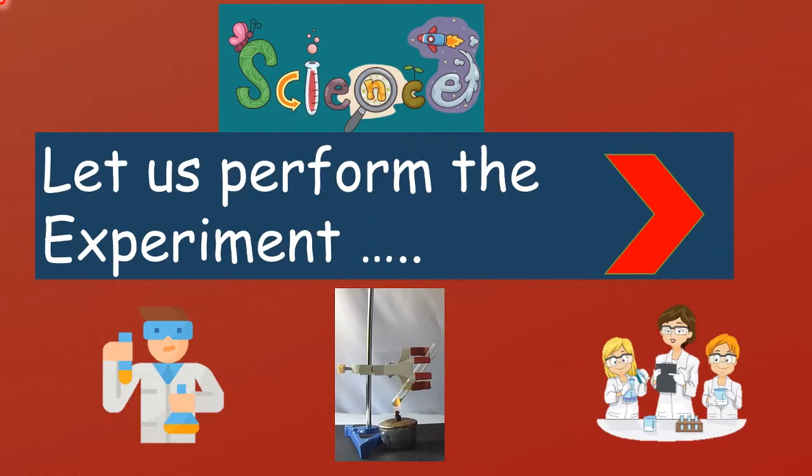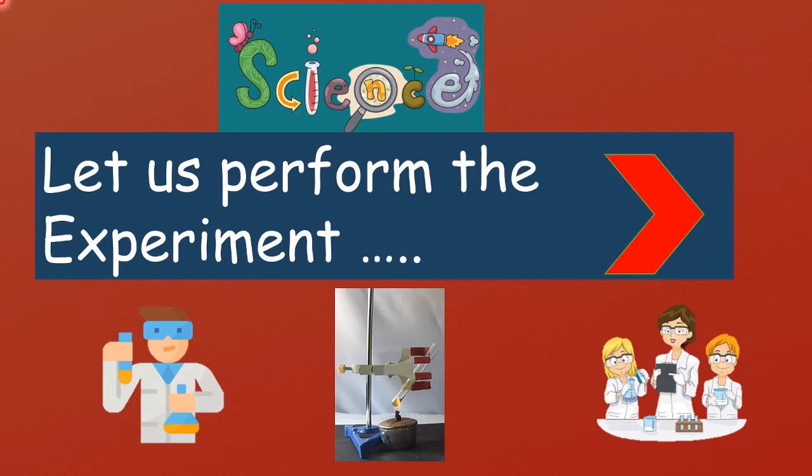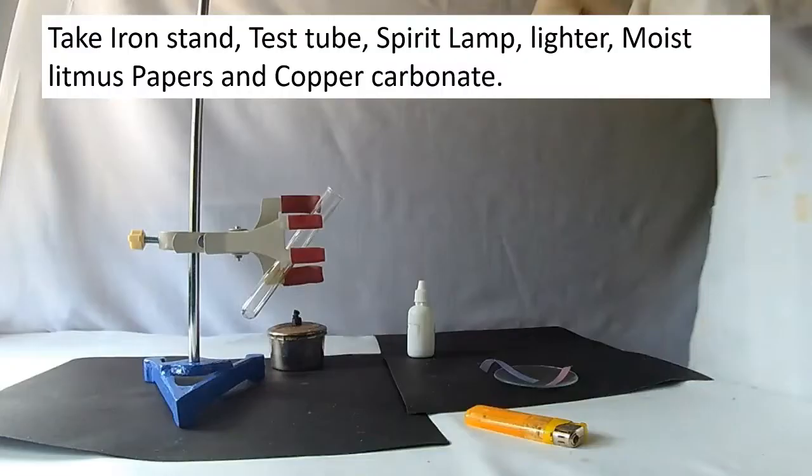Are you ready? Let us perform the experiment. Take iron stand, test tube, spirit lamp, lighter, moist litmus papers and copper carbonate.